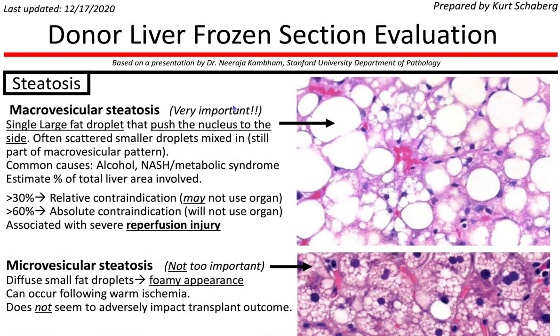Today we're going to use Kurt's notes to talk about donor liver and kidney frozen section evaluation.